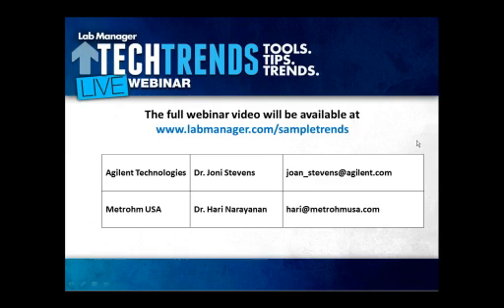Yeah, especially for trace analysis, when we are talking about the ppb level in IC applications, manual sample preparation is absolutely not recommended, because you really never know from where the fluoride impurity or the sodium impurities are coming. So the best practice for trace analysis using the IC is to use automated sample preparation and to automate the calibration, also using a single stock standard.